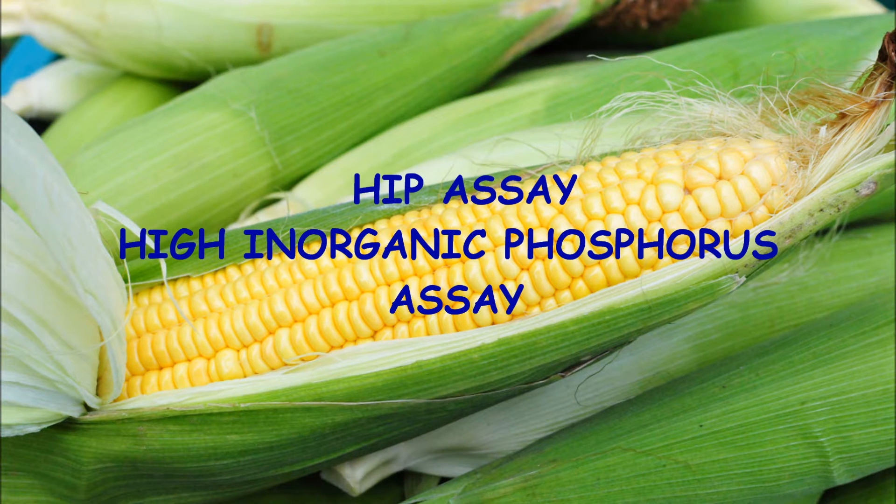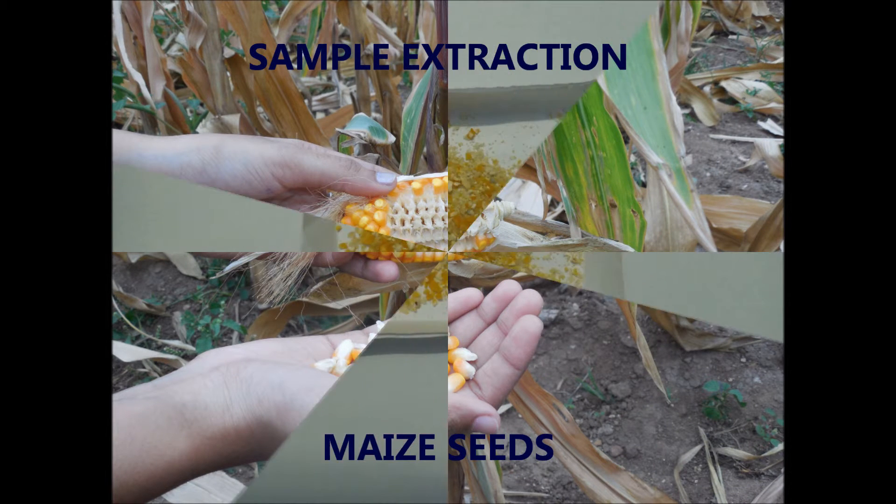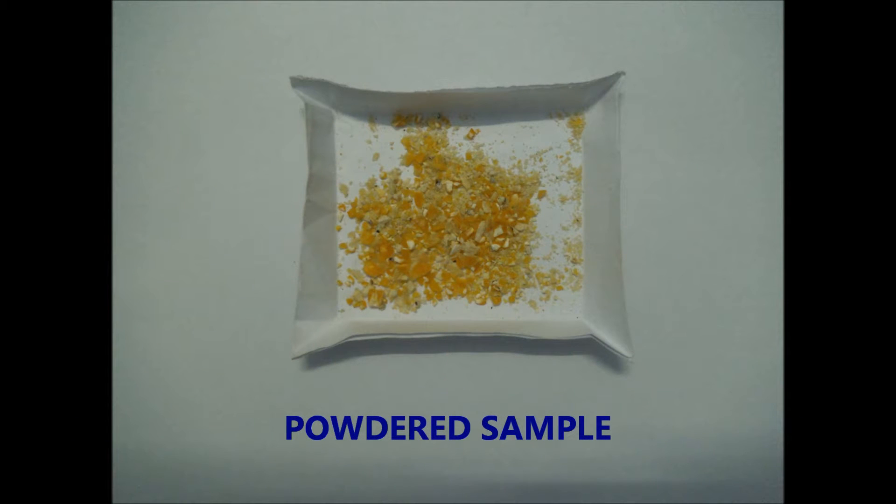High Inorganic Phosphorus Assay is used to estimate the amount of free phosphorus. For sample extraction, rice seeds were collected and dried so that the moisture content lies between 5-12%.